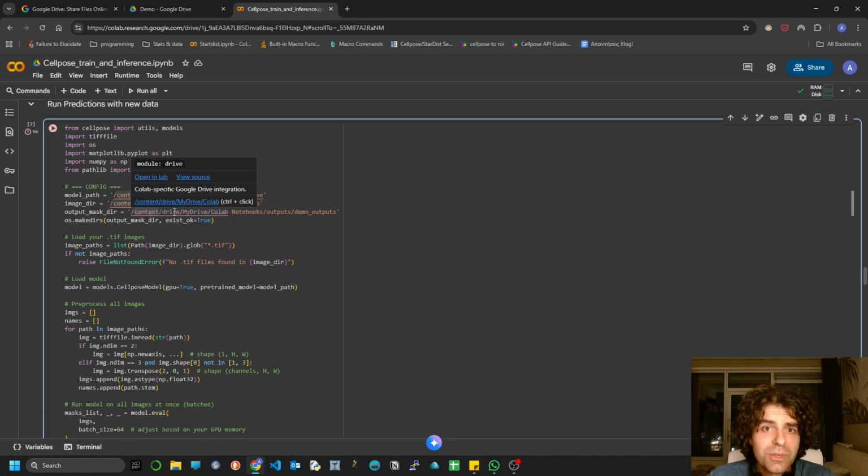We're doing so because if you're working with a large number of conditions and rows, like 5 or 10,000, which is not far from our case, you don't want to convert all these masks to rows inside this platform of Google Colab, because it will take considerable time. You're paying for that, remember?